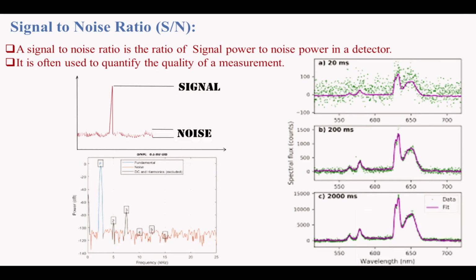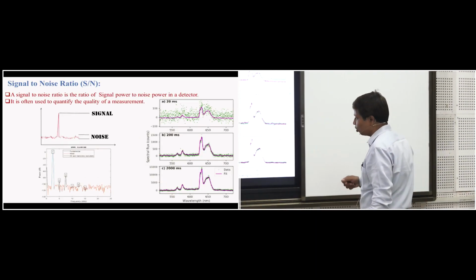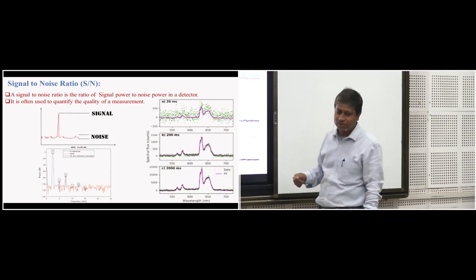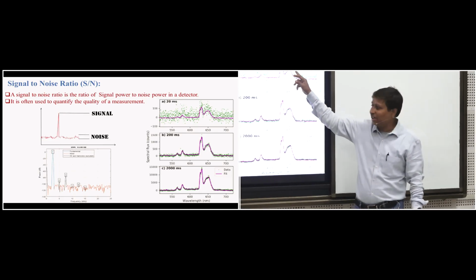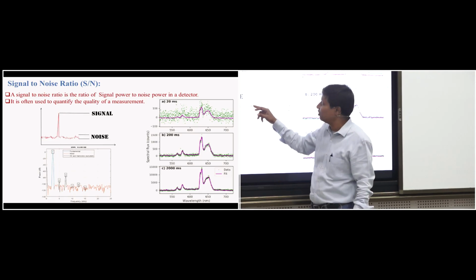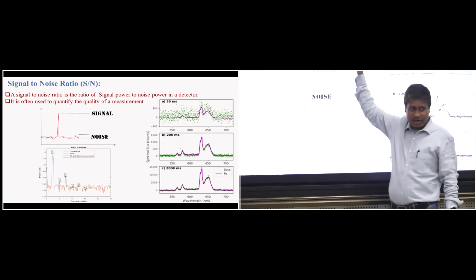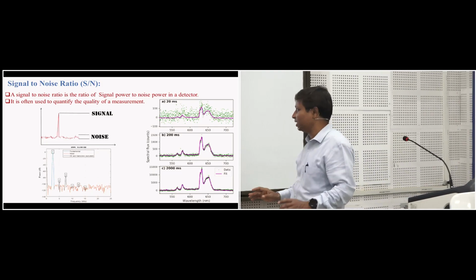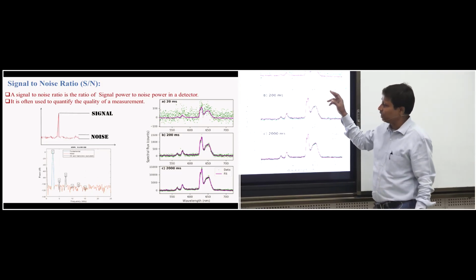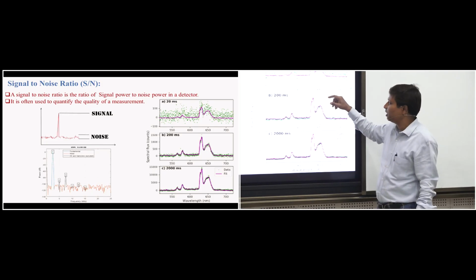When you are talking about spectrum, there are a few things you should learn, because my purpose is to make a foundation. Whenever there is an interaction and you get a signal, those who do the experiment often see that sometimes the signal doesn't come properly. Whether the signal is proper or not is given by a quantity called the SN ratio. The SN ratio will say whether the signal to noise ratio is good. There are many ways to improve the signal to noise ratio.